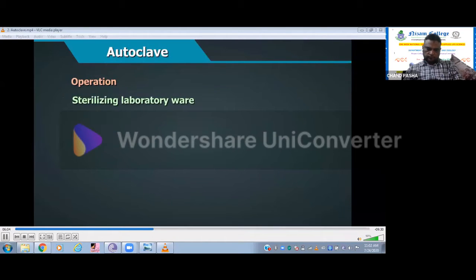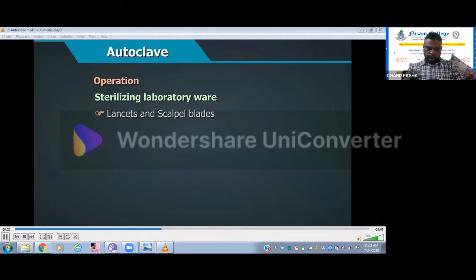Sterilizing laboratory ware. After cleaning, prepare reusable items for sterilization as follows. Syringes. Wrap polypropylene, nylon, or glass syringes, barrel alongside plunger, in a clean cloth and close with adhesive tape or tie with a cloth strip. Lancets and scalpel blades. Wrap stainless steel reusable lancets and scalpel blades individually in clean pieces of non-shiny porous paper and place in a small tin or other autoclavable container.